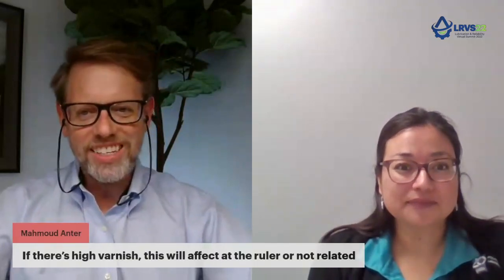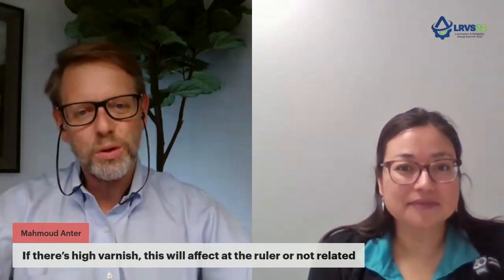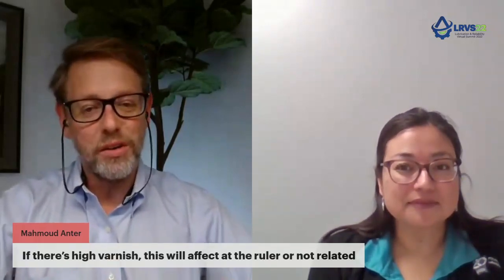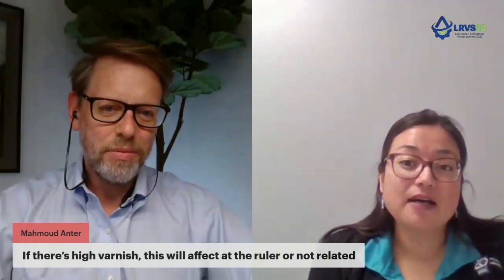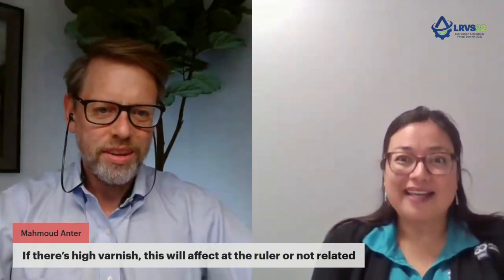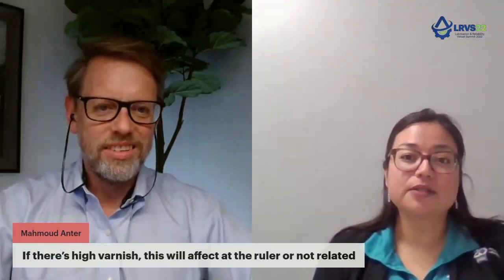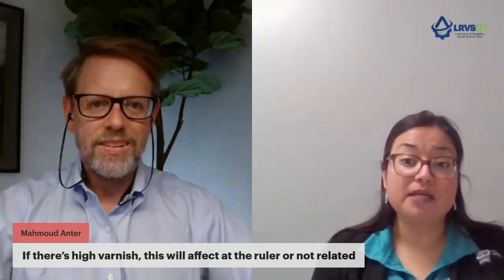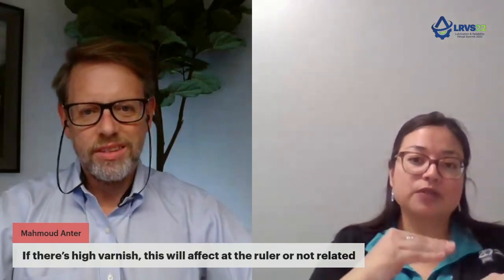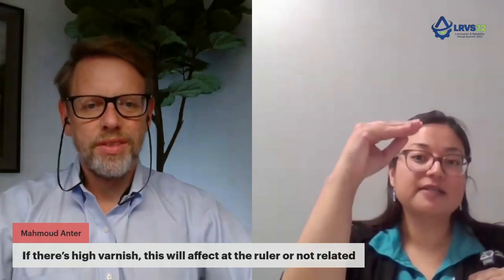This is from Mahmood. If there's high varnish, will this affect the ruler test, or is it not related? Yes, it will actually, because the antioxidants are there to help against oxidation formation. That's why they've been dubbed the antioxidants. One of the things that we have seen is as those values diminish over time, we do start correlating that with the MPC value and start seeing an increase.